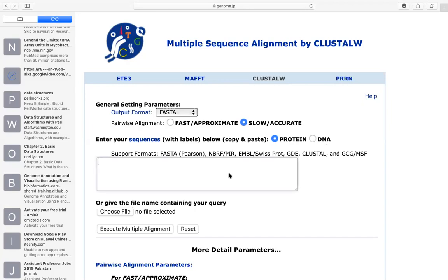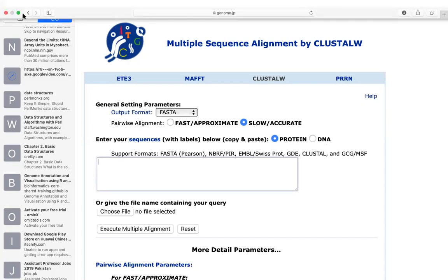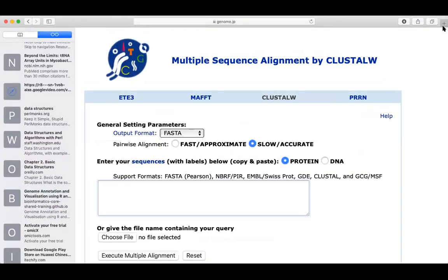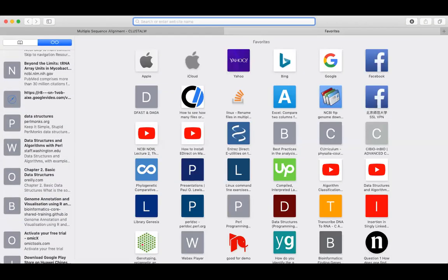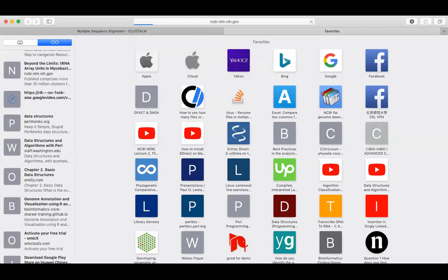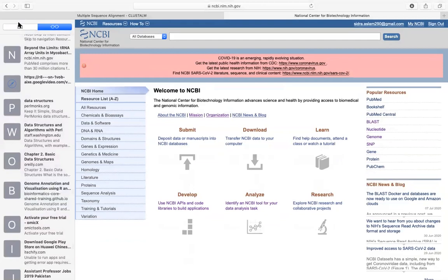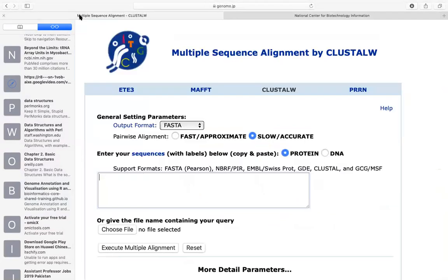Students, first of all, we need input sequences. For this, we need to go to NCBI. I have told you in class that you may have no gene or protein yet. Now we are using multiple sequence alignment, so we will need more than two sequences — three or four sequences for multiple alignment.